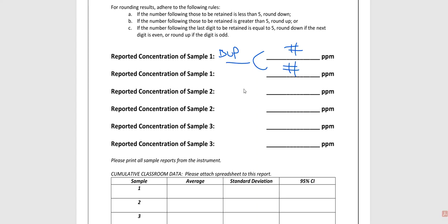We're going to change these to 4 and 5 and 6 and 7 and 8 and 9 and 10 and 11 and 12. We might have those forms ready to go if that's what you need. But however you play this, it's going to be a minimum of 3 samples that you're going to be running no matter what. All right, so let's pretend everyone in your group says, oh no, I forgot to bring samples in. I'm so sorry. That means I don't have to do work. No, we're going to run at least 3, and we've got 3 that are ready to go, and we've got 3 that you're going to be running no matter what goes on. So that is the intention of this form. If your group brought in more than 3, we'll have some extra forms that you can print off and fill out the necessary information with.